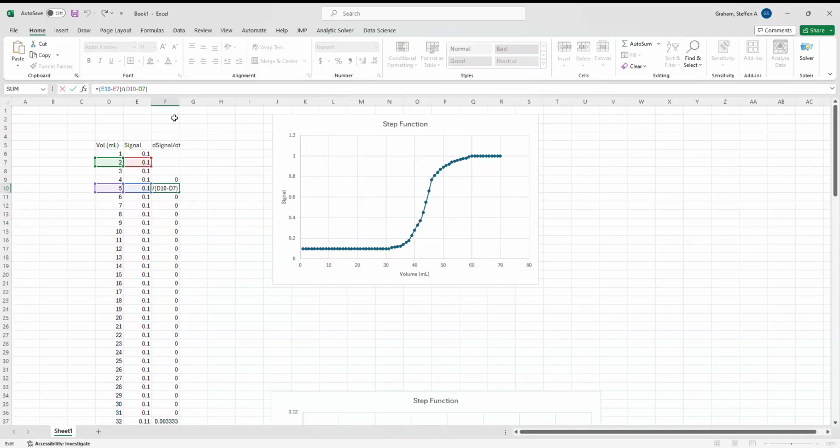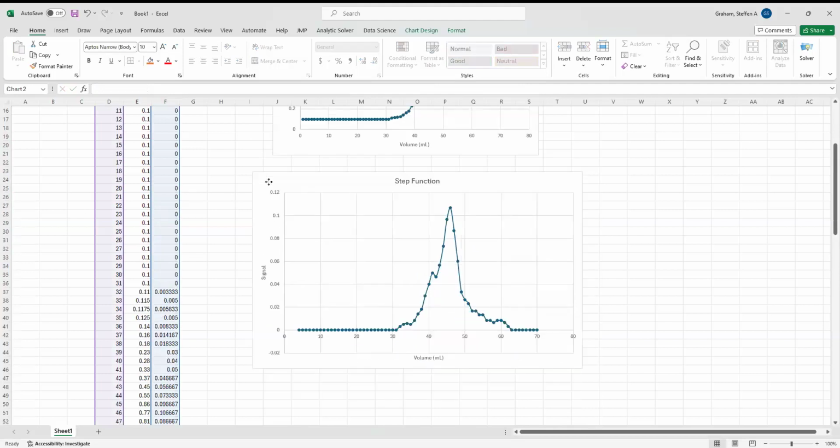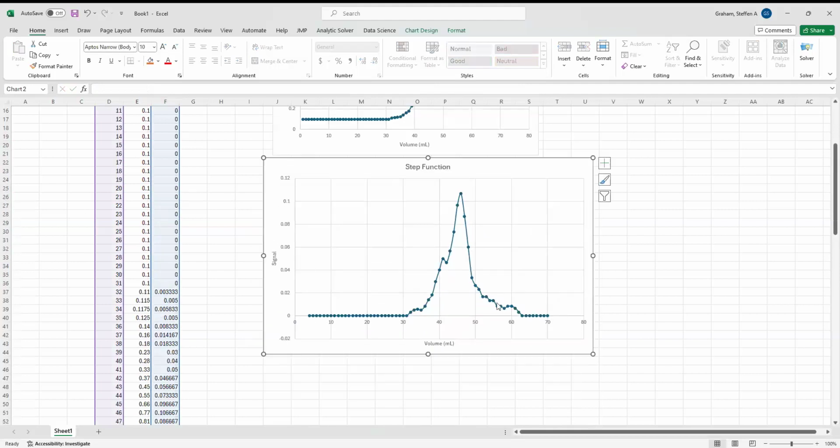If you're pulling this from Unicorn, you probably can do a lot more because their data acquisition rate can be high if you select that. But anyways, I just have the slope here calculated over 4 points, and then you got a little preview of this. This is the output. You can see where this is going, a pulse function from the phase transition.